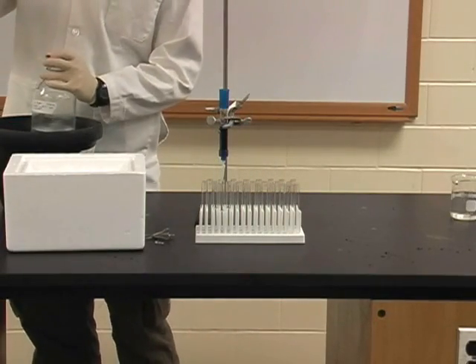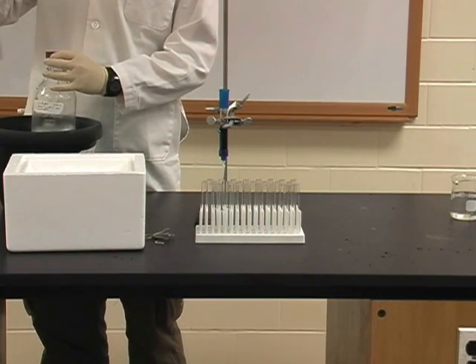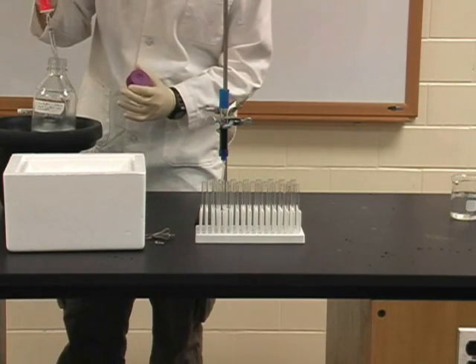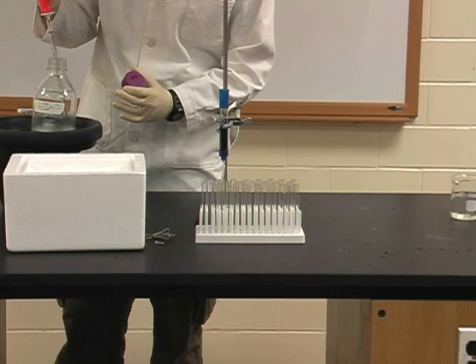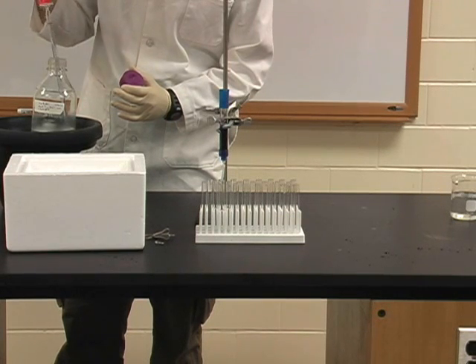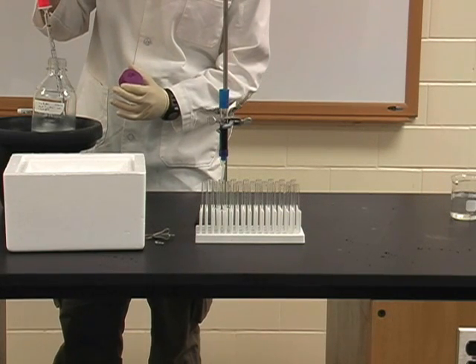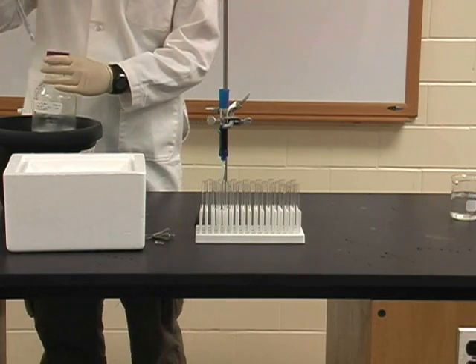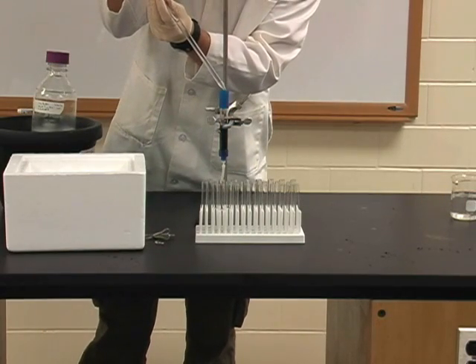After all of your sample has entered the column, you will need to add Tris PMSF buffer to the top of the column in order to keep it from drying out. If your column begins to dry out, cracks will form, which will allow your sample to flow through the cracks, bypassing the column completely, directly into your sample collection tube.